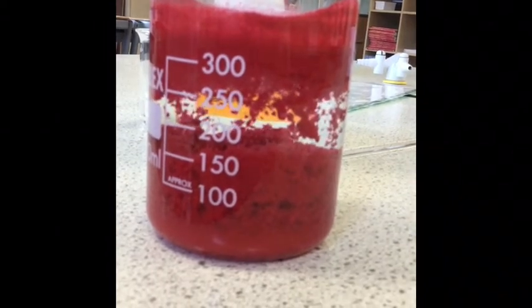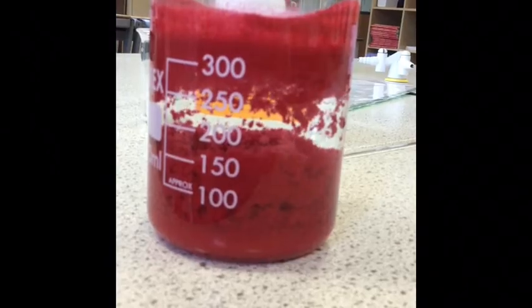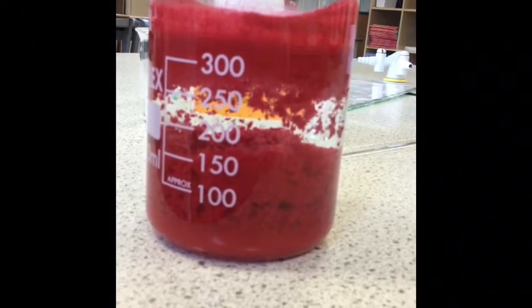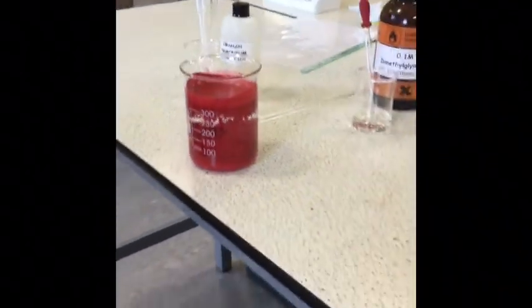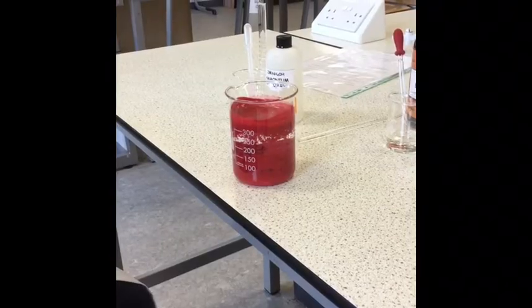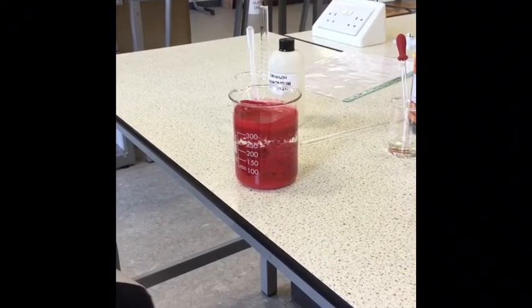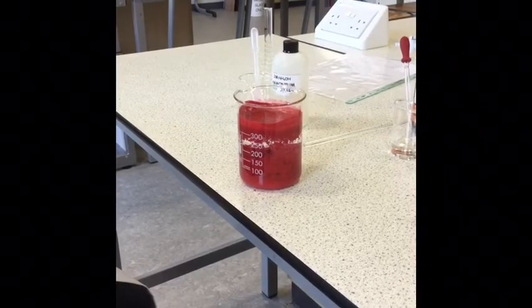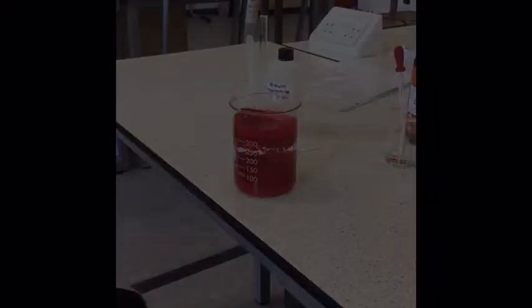So that tells us that our original precipitate included all the nickel ions. If there had been any nickel ions left in that clear area, we'd have seen more red precipitate being produced. And if that had happened, we'd have added more of the ammonium hydroxide and dimethylglyoxime. But there was no more, so that's fine.